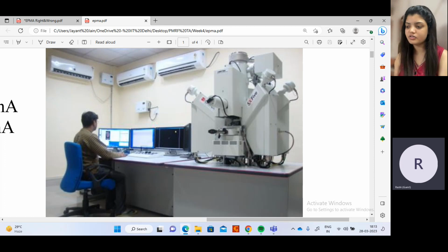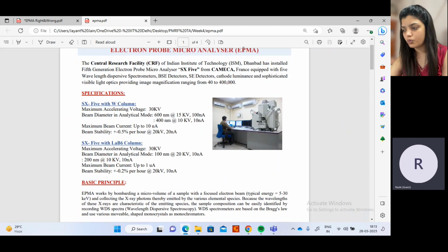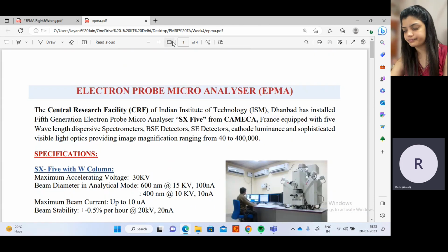I'll not be teaching how the analysis will be carried out, but a few students wanted to know how WDS works because their elements were very nearby, it seems. That's why I thought I'll just give a brief introduction on EPMA, that is WDS, where it is used in EPMA. So let's get started. So EPMA.